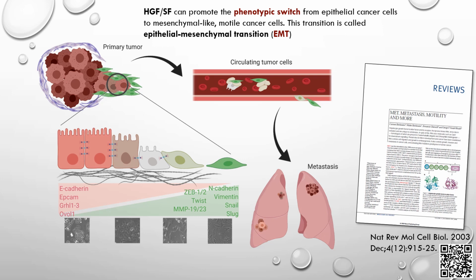I advise you to read the excellent review with the title Metastasis, Motility and More, that was published in Nature Reviews Molecular Cell Biology in 2003. I've given you the link on this slide.